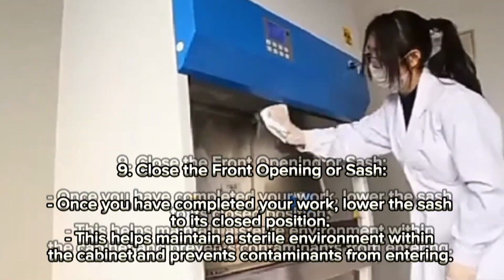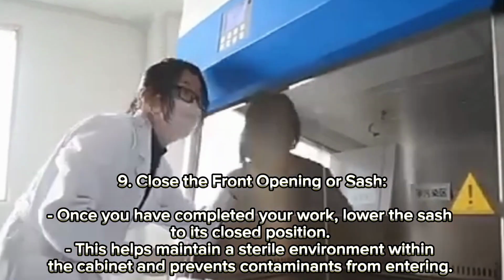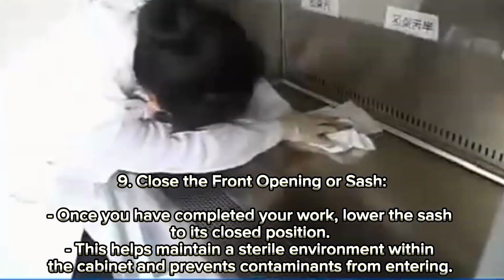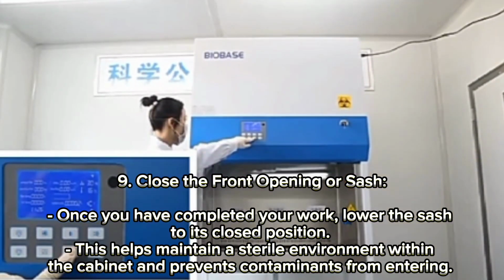Close the front opening or sash. Once you have completed your work, lower the sash to its closed position. This helps maintain a sterile environment within the cabinet and prevents contamination from entering.